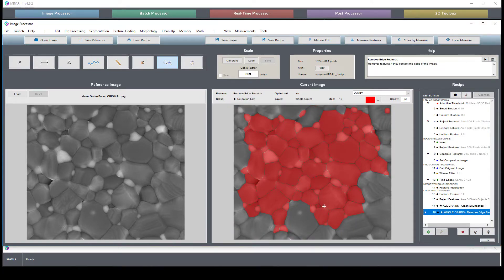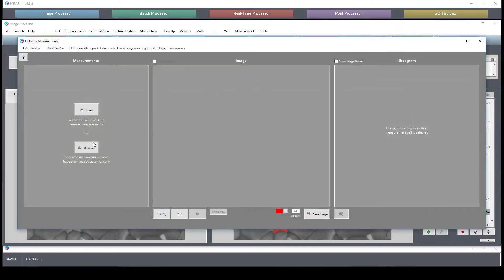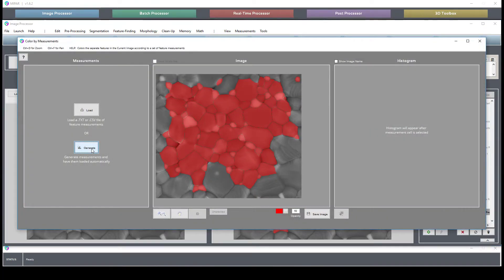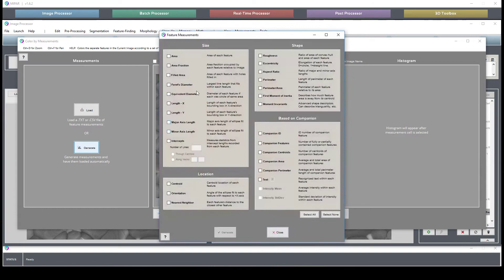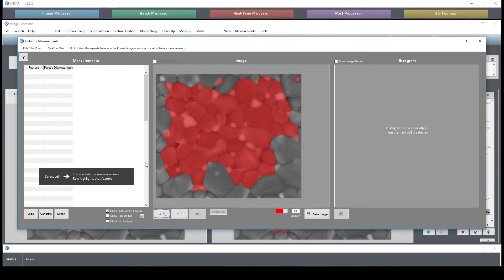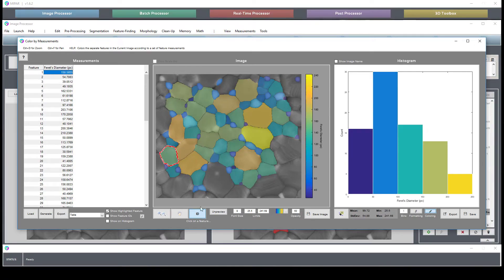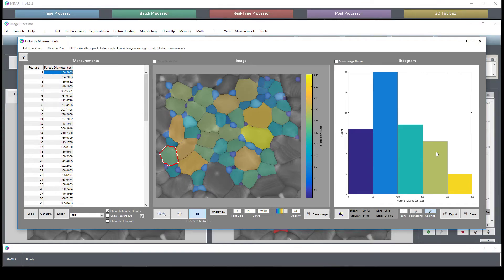So let's go in here and do a color by measure followed by a ferris diameter to take a look at the distribution. This gives us a better idea of the grain size of this sample.